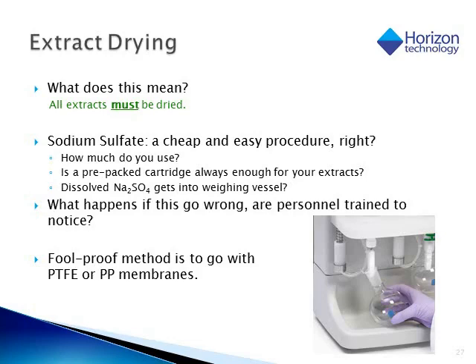So if all extracts must be dried, then some labs will just incorporate sodium sulfate into the process because it's familiar, cheap, and easy, right? Well, when your analytical technique involves using a balance to weigh the final product, there's an awful lot that can go wrong in that process.